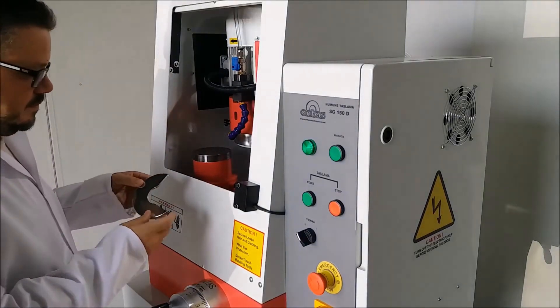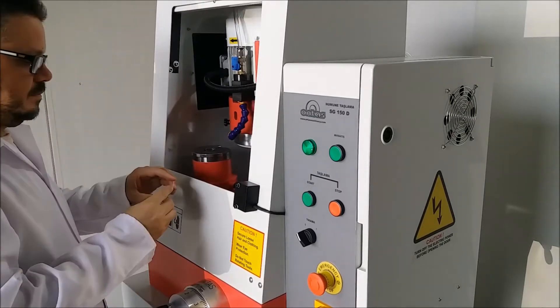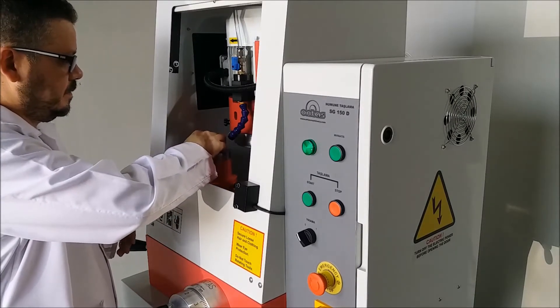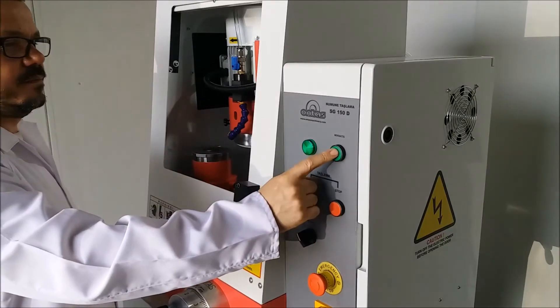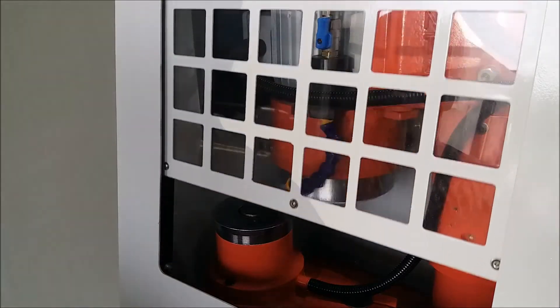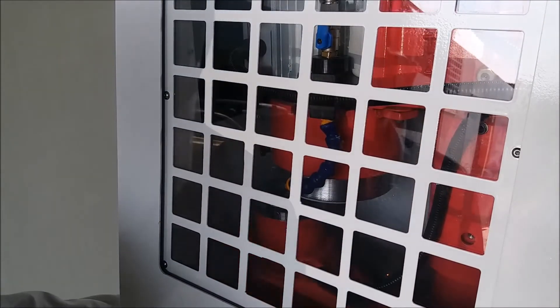New SG-150D. Push the start button when half of the piece is under the grinding stone. Stone and water pumps start working after the door closes.